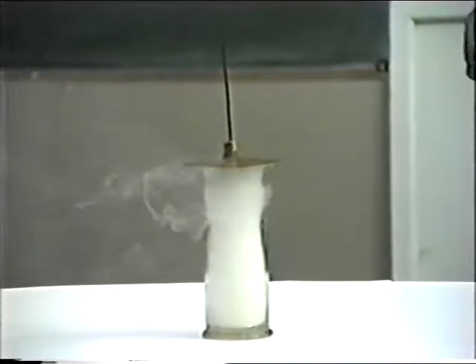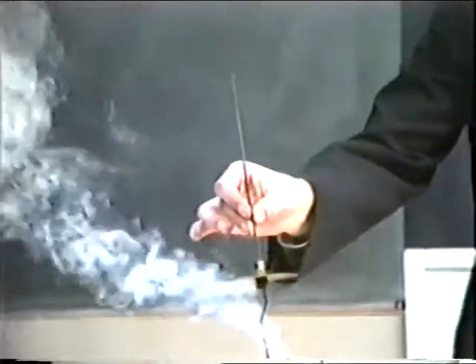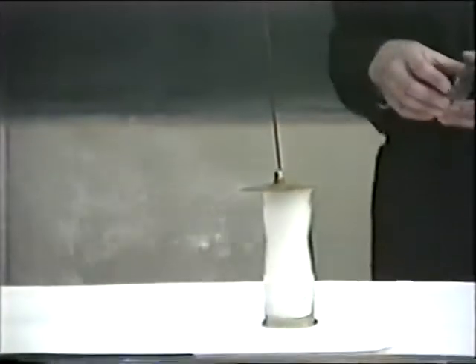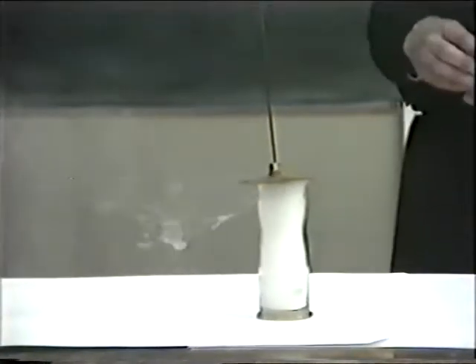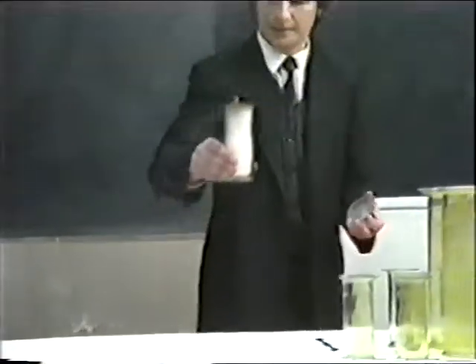And this is an example of a spontaneous reaction. By spontaneous, we mean that the reaction happens by itself, without any heating. You'd think that the phosphorus has gone out, but if we raise the deflagrating spoon out of the jar, you will observe that the phosphorus is in fact continuing to burn extremely effectively. In oxygen, the white smoke which is formed is phosphorus pentoxide, whereas in chlorine, the white smoke is phosphorus trichloride.